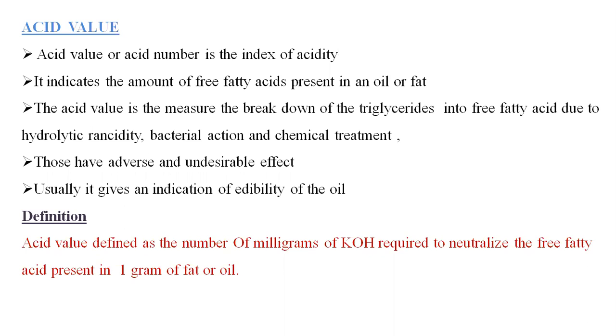So the definition of acid value is the number of milligrams of KOH required to neutralize the free fatty acid present in 1 gram of fat or oil. So when we take 1 gram of fat or oil, how much of the fat is degraded or rancified into free fatty acid and glycerol? For that purpose, how many milligrams of KOH are consumed or required to neutralize the acid produced due to the rancidity.